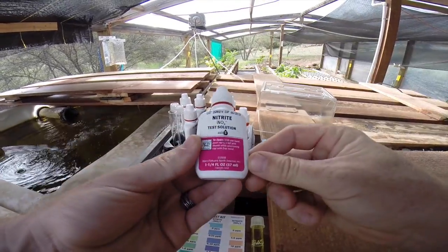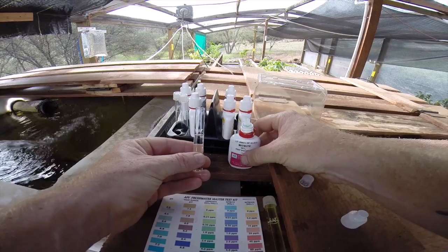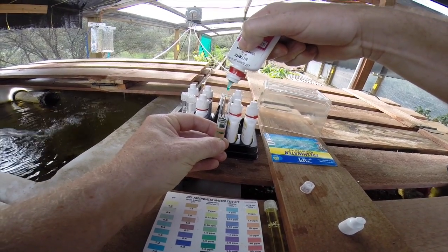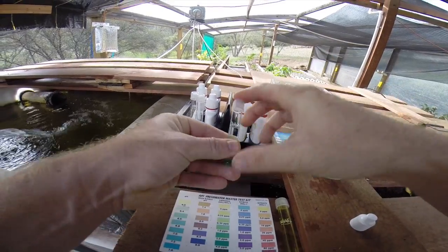Now we'll test the nitrite levels. Fill a clean test tube to the 5ml mark and add 5 drops of nitrite test solution. Cap the tube and shake for 5 seconds, then wait 5 minutes for the color to develop.